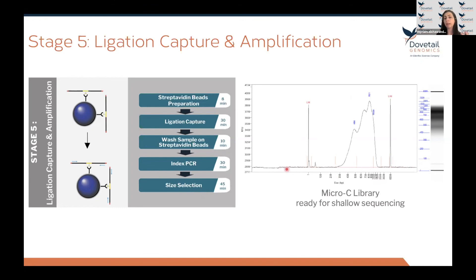Run the final library on a Fragment Analyzer, Bioanalyzer, or TapeStation to confirm the expected size range of 350 to 1,000 base pairs. The library is then ready for paired-end sequencing on any Illumina sequencing platform. The protocol as written is specific to the Dovetail library prep module and primer sets, offered as add-on modules for a more streamlined workflow. If you prefer a third-party library preparation kit used routinely in your lab, please reach out — we can confirm compatibility and how to integrate it. Before deep sequencing, we recommend shallow sequencing between one to two million read pairs and running a QC analysis to assess library quality prior to deep sequencing.